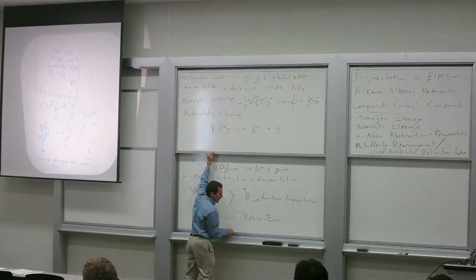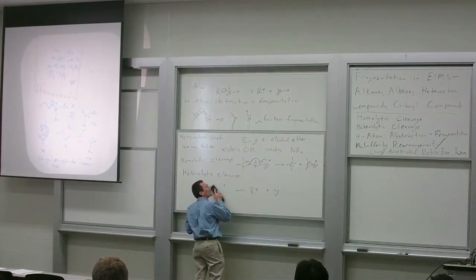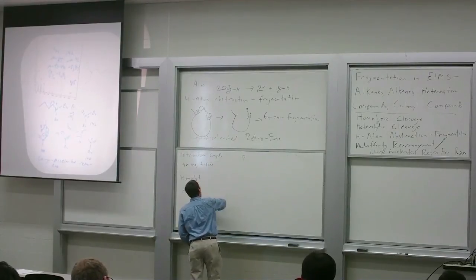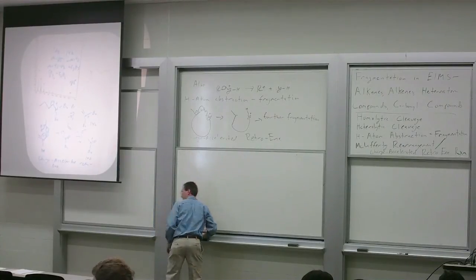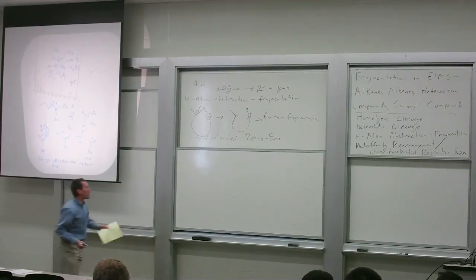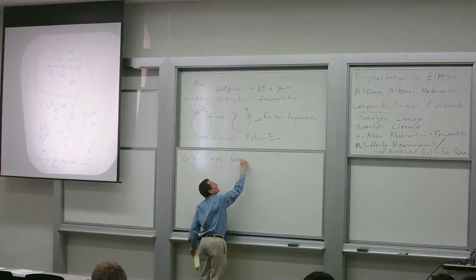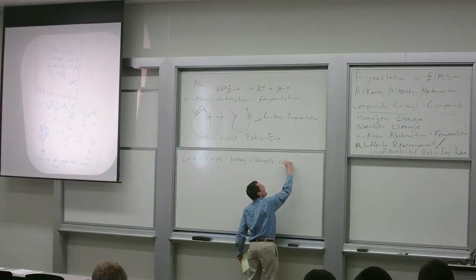I want us to do is to talk about carbonyl compounds. So by carbonyl compounds, I mean the whole family. Ketones, aldehydes, esters, amides, etc.